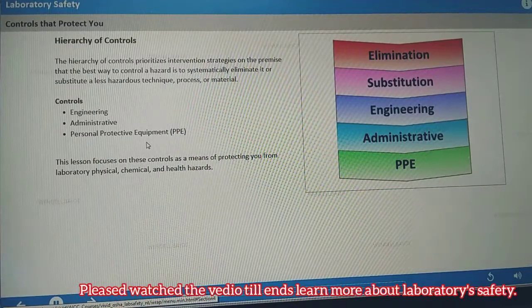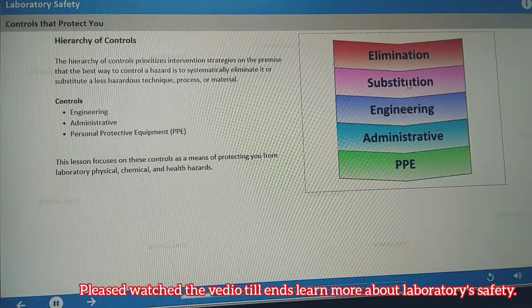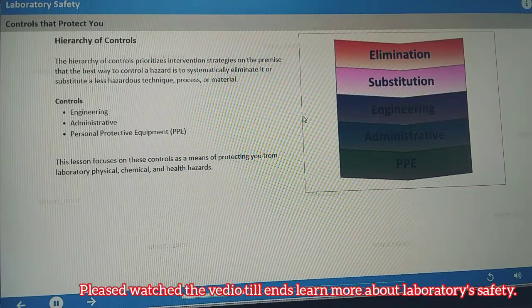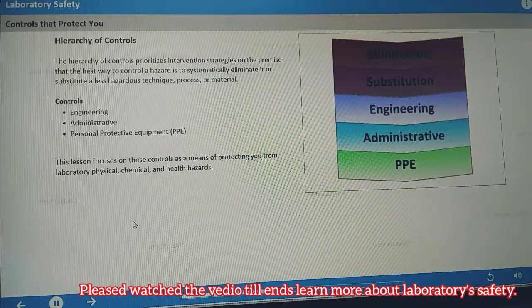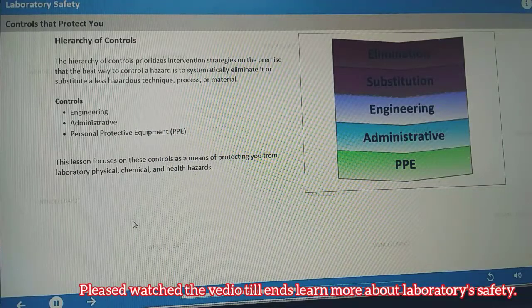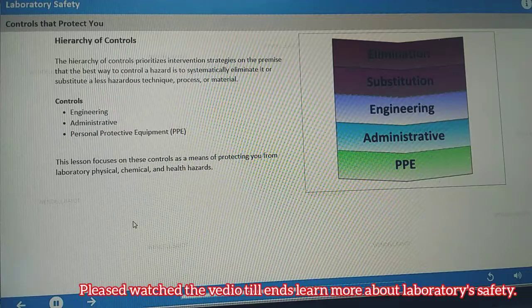The Hierarchy of Controls prioritizes hazard mitigation strategies on the premise that the best way to control a hazard is to systematically eliminate it or substitute a less hazardous technique, process, or material. If elimination and substitution aren't feasible, your laboratory will implement the necessary engineering and administrative controls and determine the appropriate level of personal protective equipment — PPE — to provide as much protection as necessary.